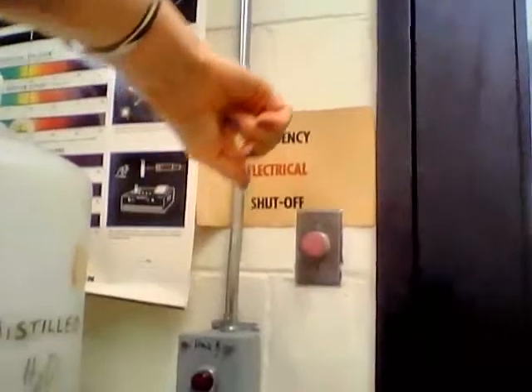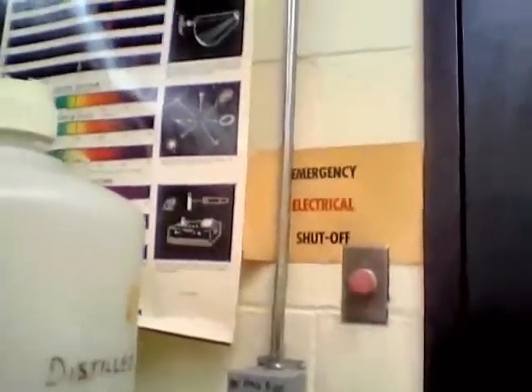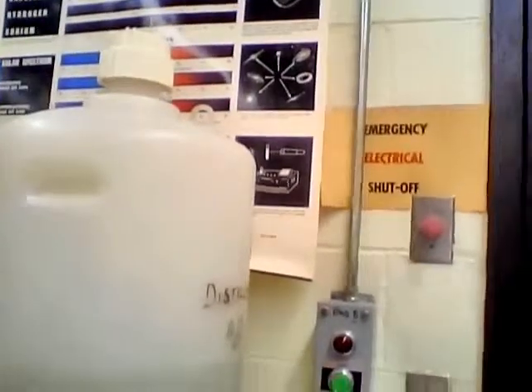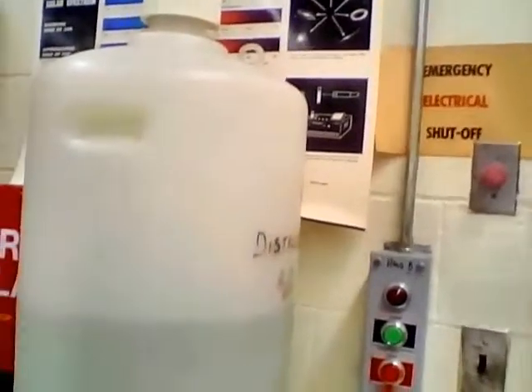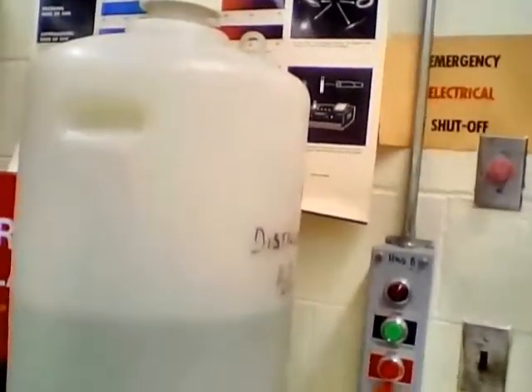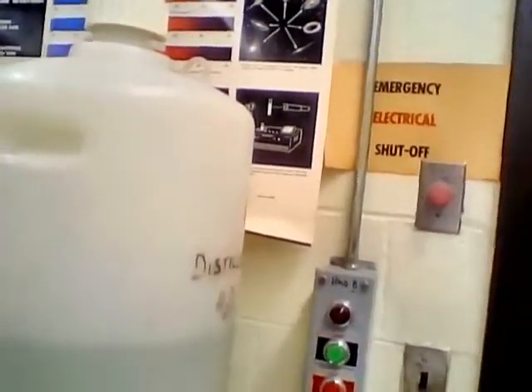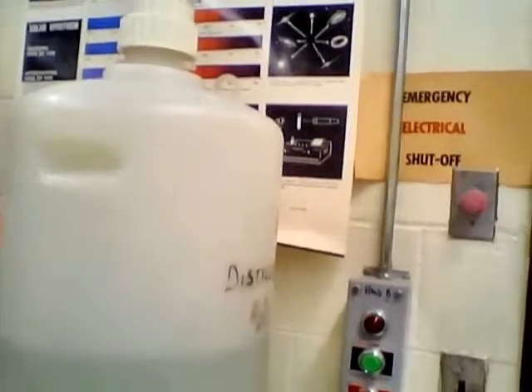Well, right next to this back door, we have this emergency electrical shutoff button, so that shuts off the electricity and gas to the lab benches. It does not shut off the overhead lights though, so that's good. And you'll notice there's actually another one of those next to the other door. I'll walk by that eventually.